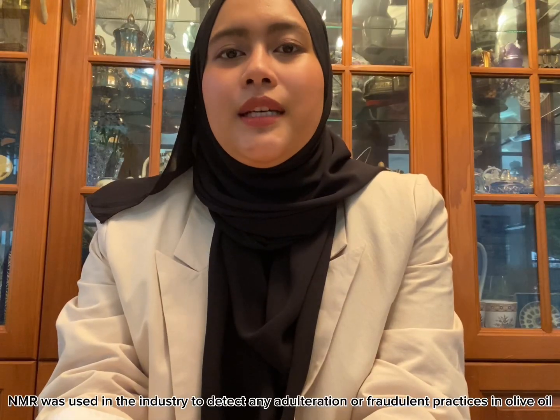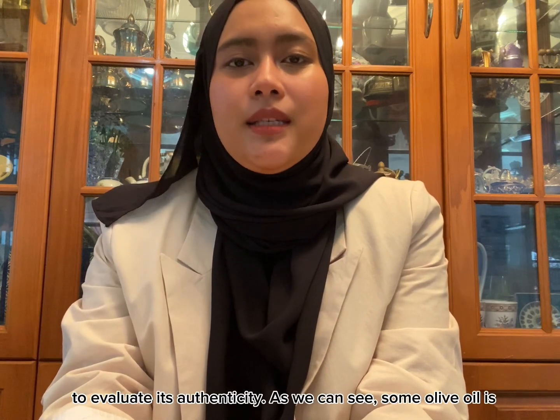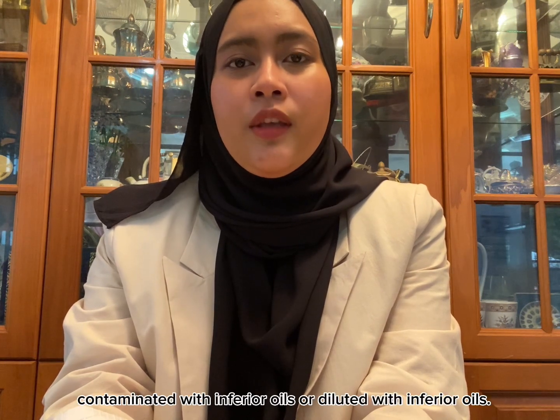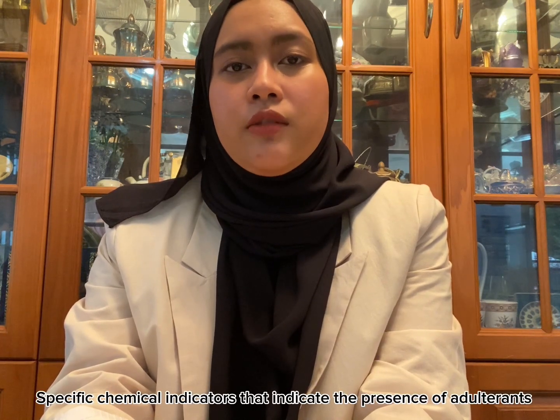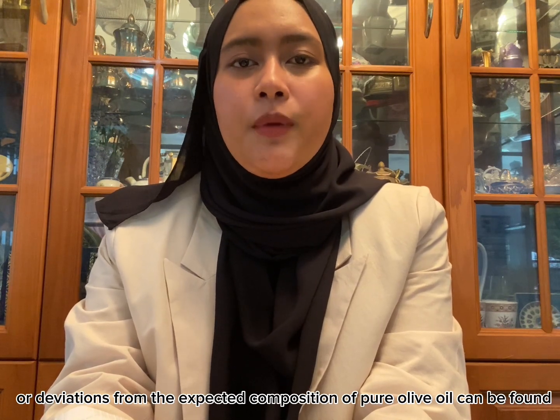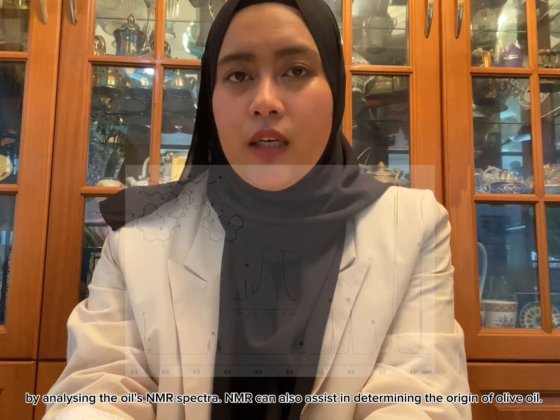NMR is used in the industry to detect any adulterant or fraudulent practices in olive oil to evaluate its authenticity. As we can see, some olive oil is contaminated or diluted with inferior oils. Specific chemical indicators that indicate the presence of adulterants or deviations from the expected composition of pure olive oil can be found by analyzing the oil's NMR spectra.